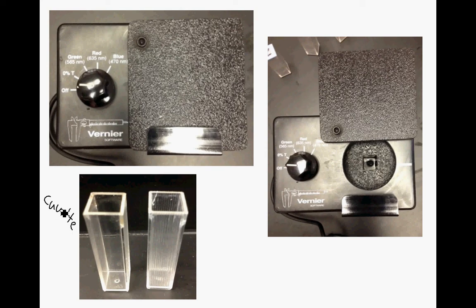A cuvette is a little tiny plastic thing, and there are two sides. This side is not ridged, and then this side is ridged. These ridged and non-ridged sides are turned 90 degrees from one another on the same cuvette.